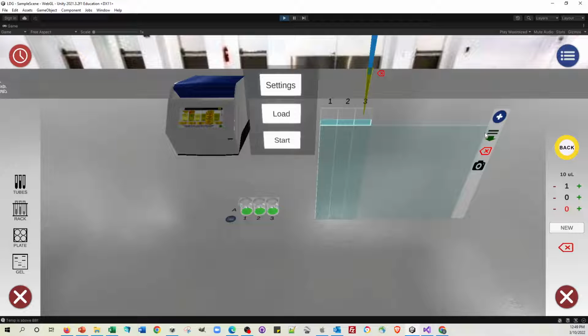And if we run them, then we get some bands, and they're not quite as clean as previous bands because they are made up of quite a few little sub things, because there are lots of little reactions going on in there, and we'll tidy that up. But basically, it is working.